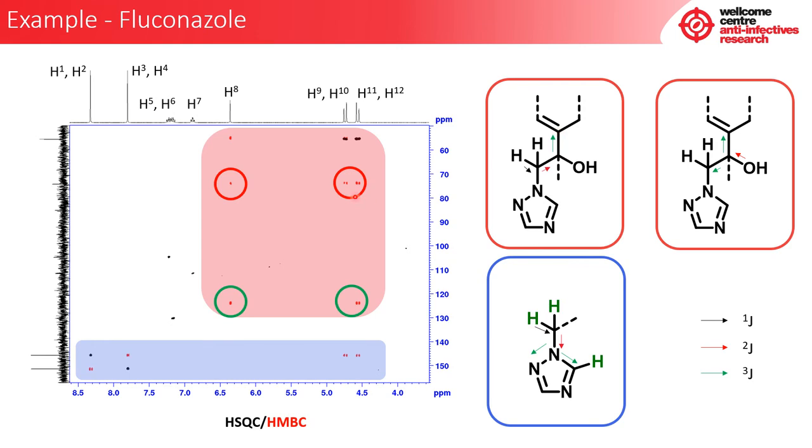When looking here at this one, we can then say, okay, well, what's this quaternary carbon then? We need to start counting that too. We can say that just by looking at the carbon spectra, it's some form of aliphatic peak because of where it falls in the carbon spectra. So again, we can start to do our counting and realise actually that this is accounting for 2 bonds away, 1 and 2, because here is the quaternary carbon that's aliphatic.